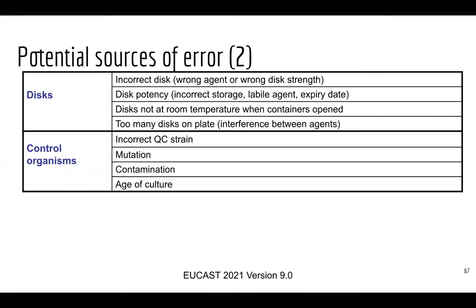You don't tend to find a mechanism or mutation which is so obvious in bacteria. If you subculture for a very long time, you'll start to get mutations caused by the fact that you're using these bacteria in certain conditions, and they select for those conditions, and then they don't have selection anymore. So they just rack up the mutations, and in fact, they might no longer be susceptible to certain antibiotics or gain susceptibility and stuff like that. So it's important to make sure that your quality control of these control organisms is good, so you don't lose the accuracy of your experiments and don't find the wrong result.